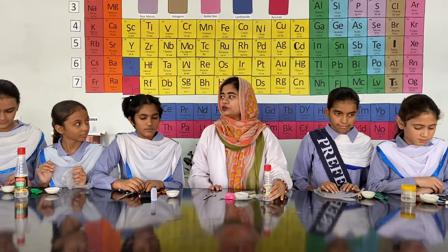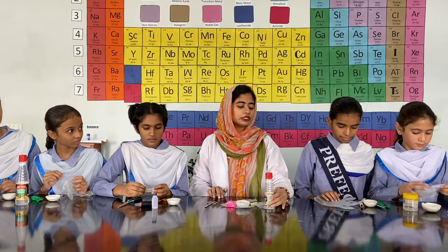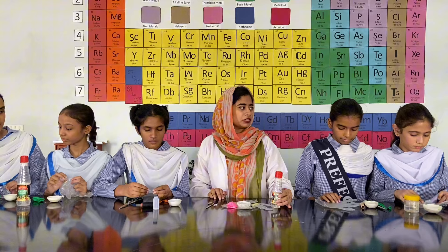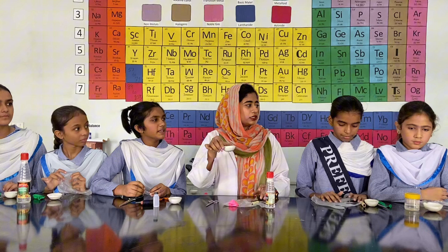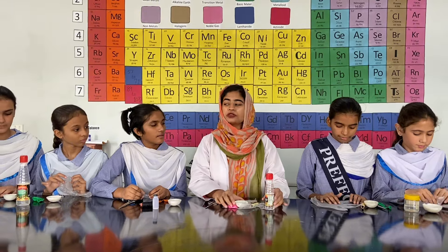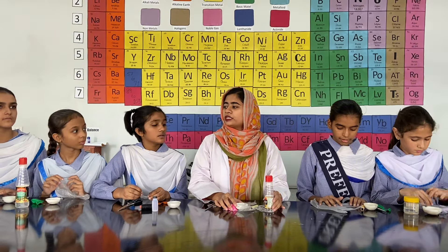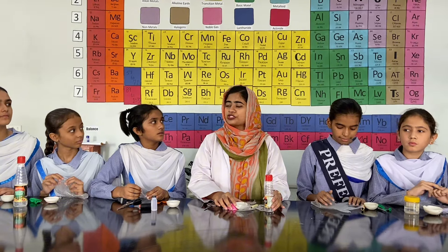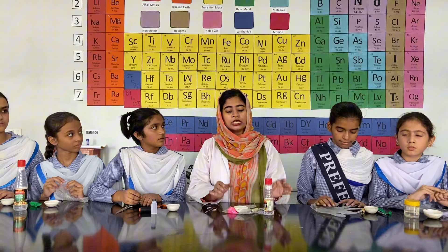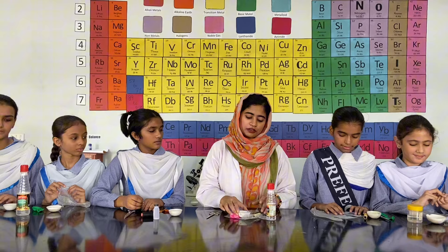Students, we are going to start an activity on chemical change. In this, we will do the experiment of the reaction between vinegar and baking soda. When these two substances react, it will form carbon dioxide gas, and it will have a totally different structure and composition because carbon dioxide is a gas. So let's start our experiment.